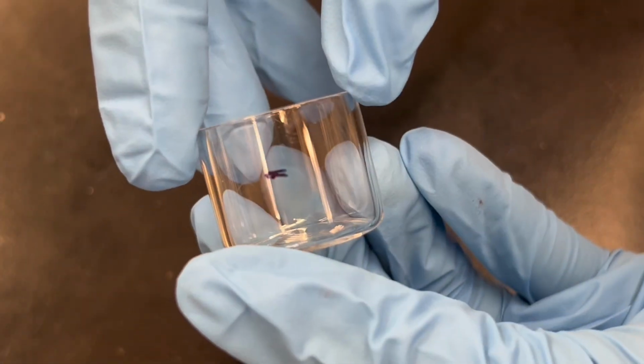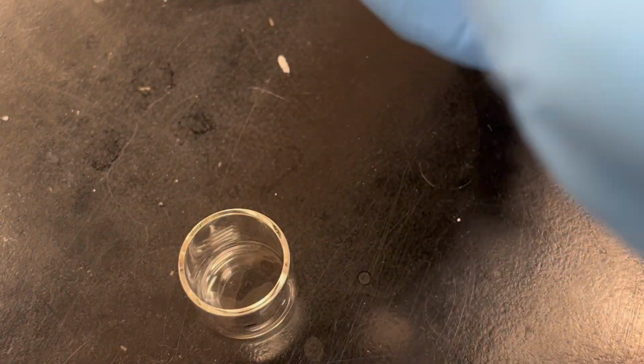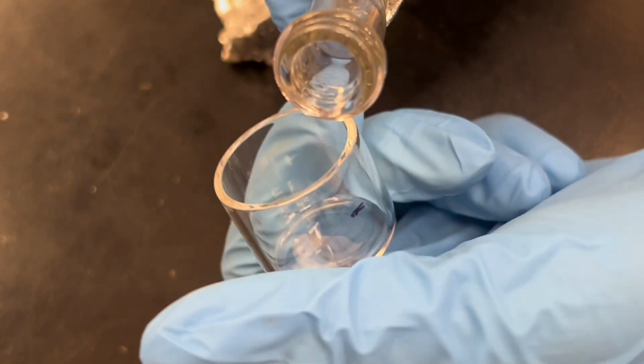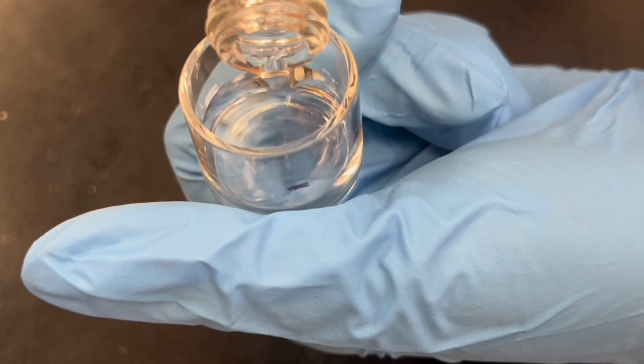Because we're not making exactly 5 ml of the solution that we need each time, I used a volumetric flask to measure how much is 5 ml of liquid in the cell, and I drew a line on it so we could get close to 5 ml when we pour the solution in and use it in the cell.